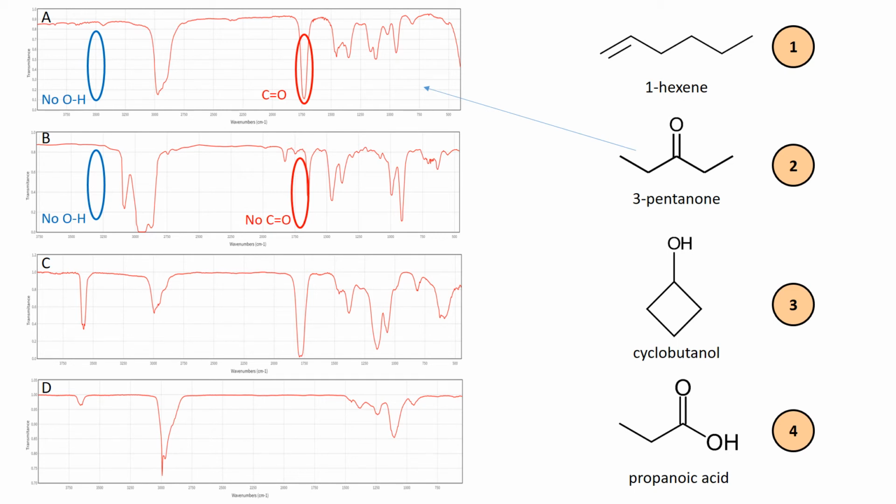Once again there is no carbonyl peak here. There is a peak at about 3,000 wave numbers that is responsible for CH stretches, and you see this in any compound with carbon and hydrogen, usually quite a broad, intense peak at about 3,000 wave numbers.